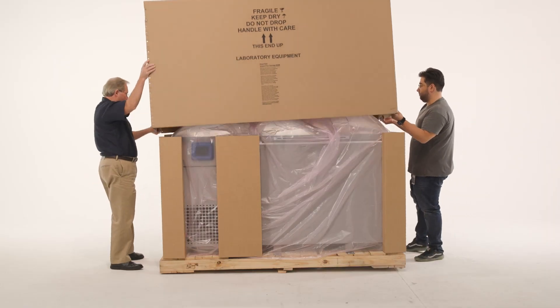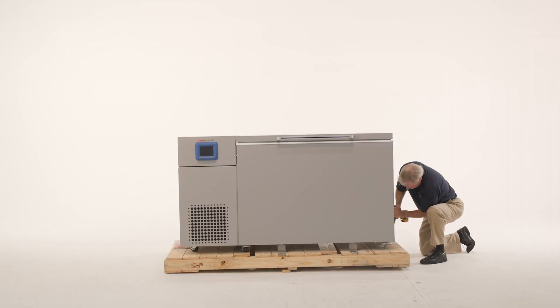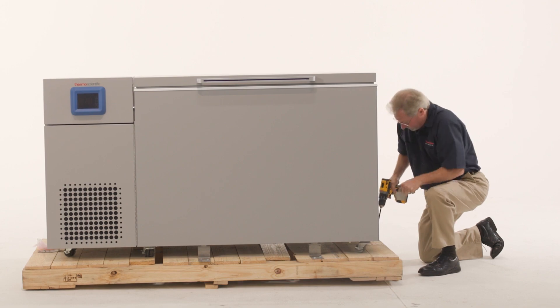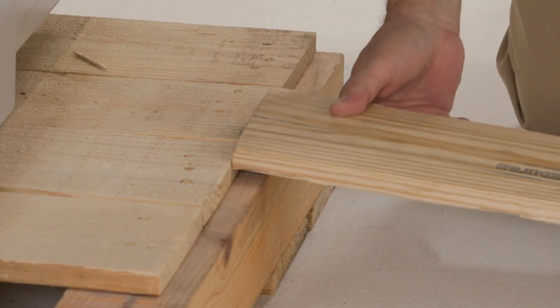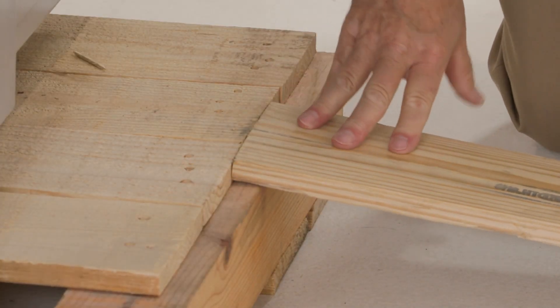When you receive your TDE minus 80°C chest freezer, use a 7/16 inch wrench to remove all the bolts securing the shipping bracket to the pallet. Remove the shipping bracket. Remove the ramp boards from the pallet and place the slotted end over the ramp brackets on the pallet. The support blocks on the ramps will be facing down.